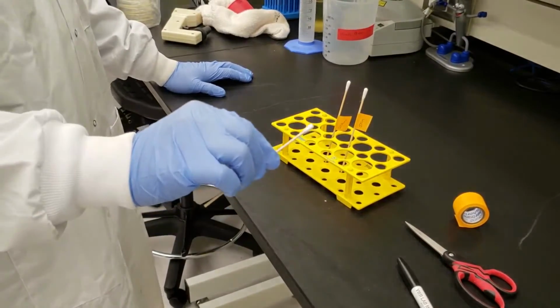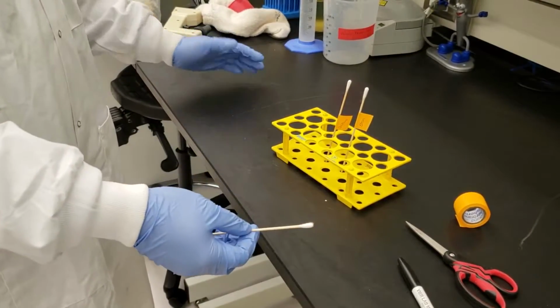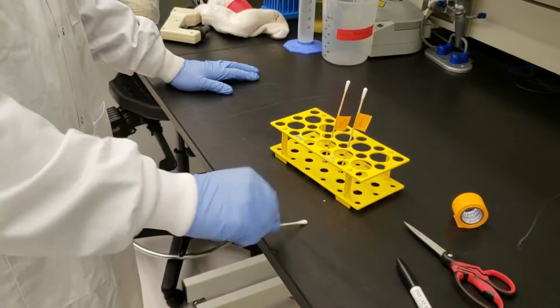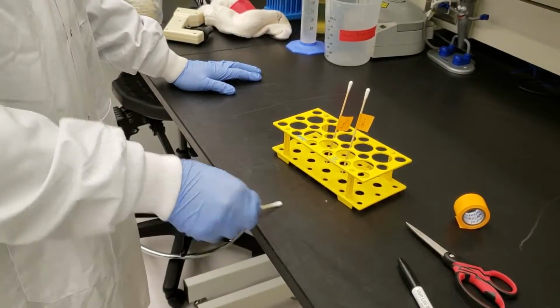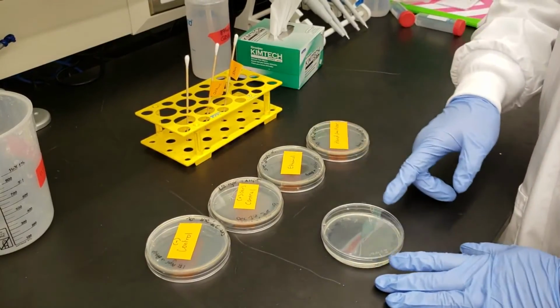Now for sample collection, you're going to take your swab, and whatever surface you go to, make sure that you move the swab around completely to maximize any pickup of any critters you're going to get. Now once you've collected your samples, it's time to plate them.